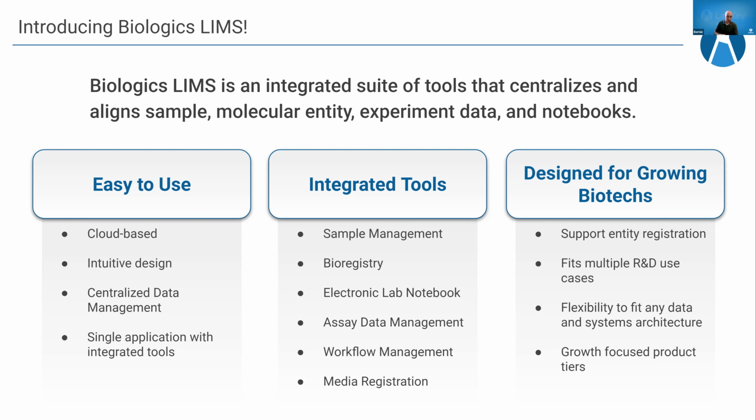Then there's data standardization, and I'm going to add conventions to that. If the way I capture data and metadata about a vector or cell line suits me nicely, but it's missing critical information or is in a difficult format for the team I'm passing data to, it's going to slow down our collaboration and maybe the whole process entirely. It's going to really also annoy your data scientists later.